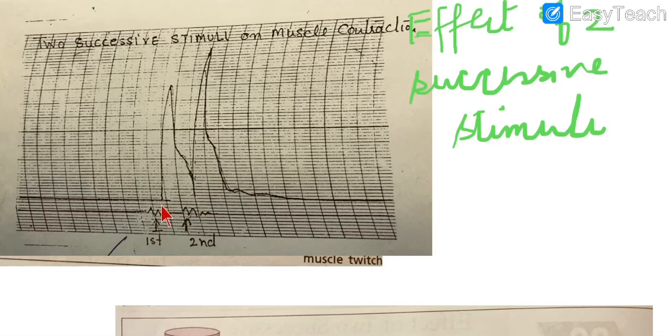Initially at this point we provided the stimulus, we got the contraction phase, and in the midway of the relaxation phase, when the relaxation phase is still not complete, we provided the second stimulus. So what is the effect we are getting? Before it gets completely relaxed, we have provided the second stimulus, so obviously the contraction has started beforehand. It won't complete the relaxation; rather there will be the starting of the contraction phase. And what we see is that this height is increased. This is the additive effect, and then it will come downward, right? So what is the effect of the successive stimuli?